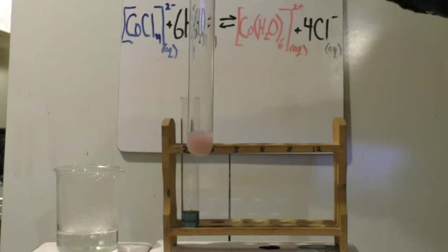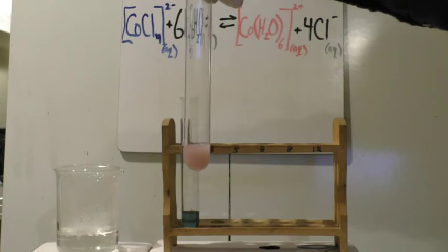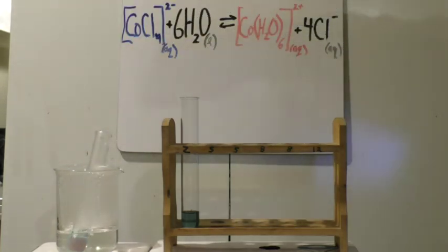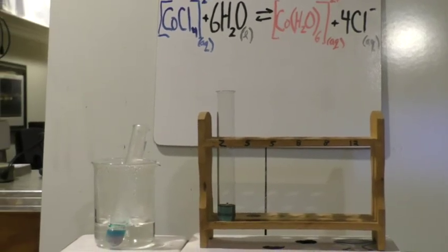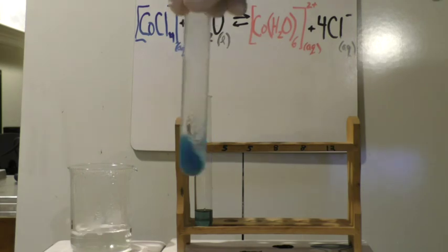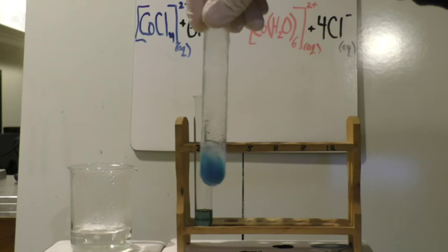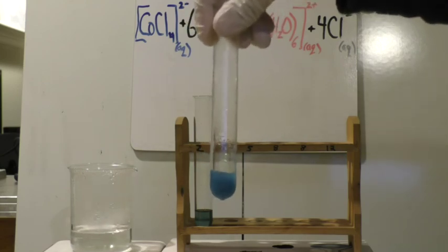So I wonder what would happen if I put this equilibrium that lies to the right now in hot water, which appeared to make it turn blue. Will this make that happen? Looks like it does. So even removing chloride ions with silver is no match for changing the equilibrium constant K by changing the temperature.